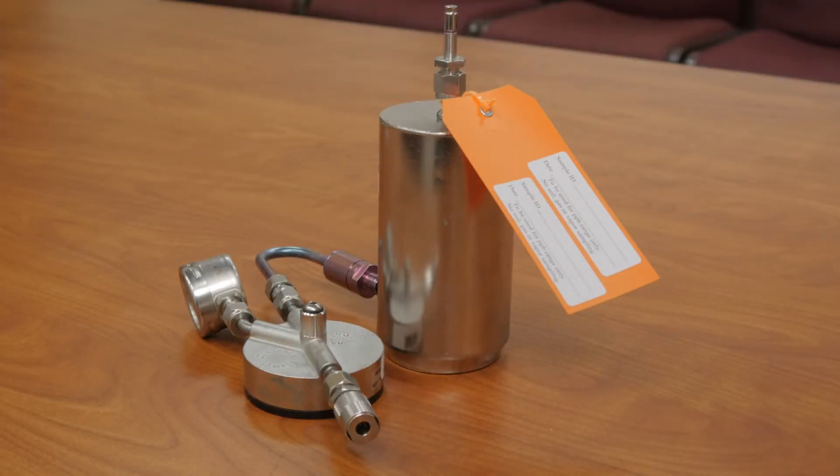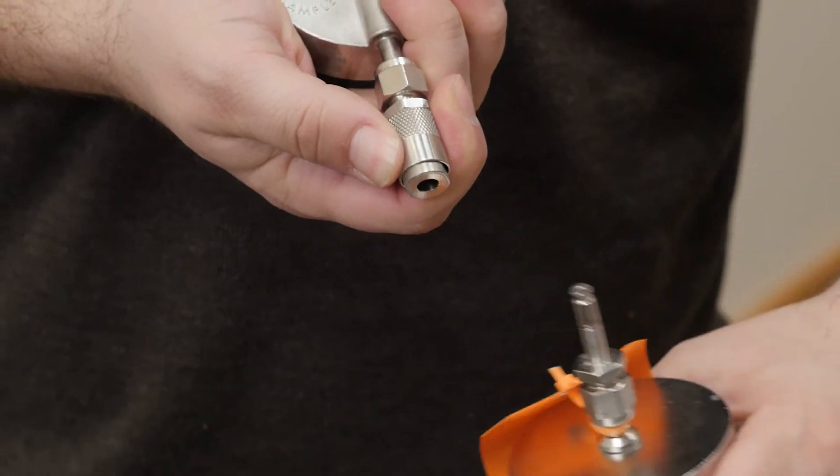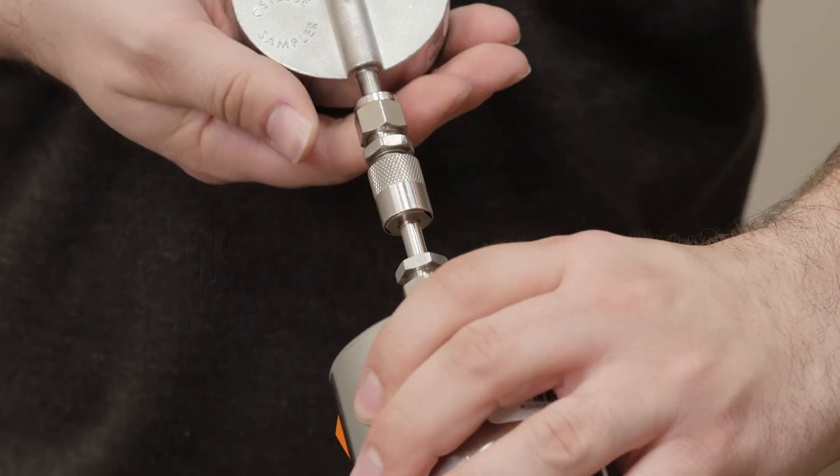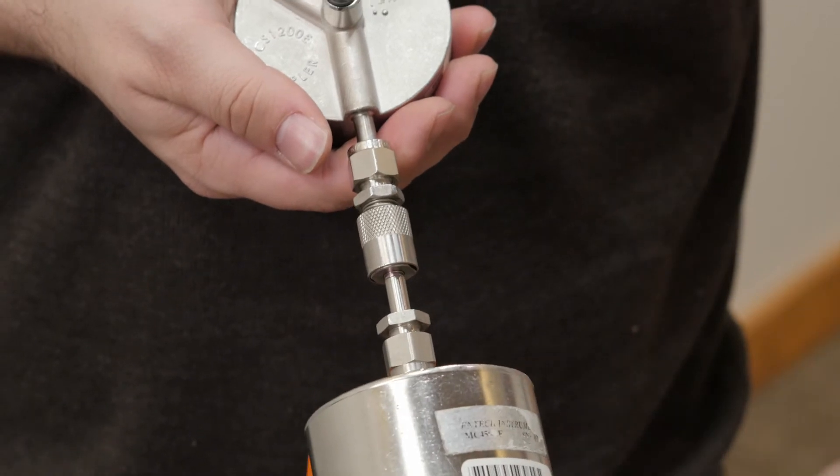Next, set up the MiniCan stainless steel canister and integrated regulator for total VOC. To begin sampling, pull back on the collar of the regulator. Insert the MiniCan fully and release the regulator collar. Once the MiniCan snaps into place, the sample has started.